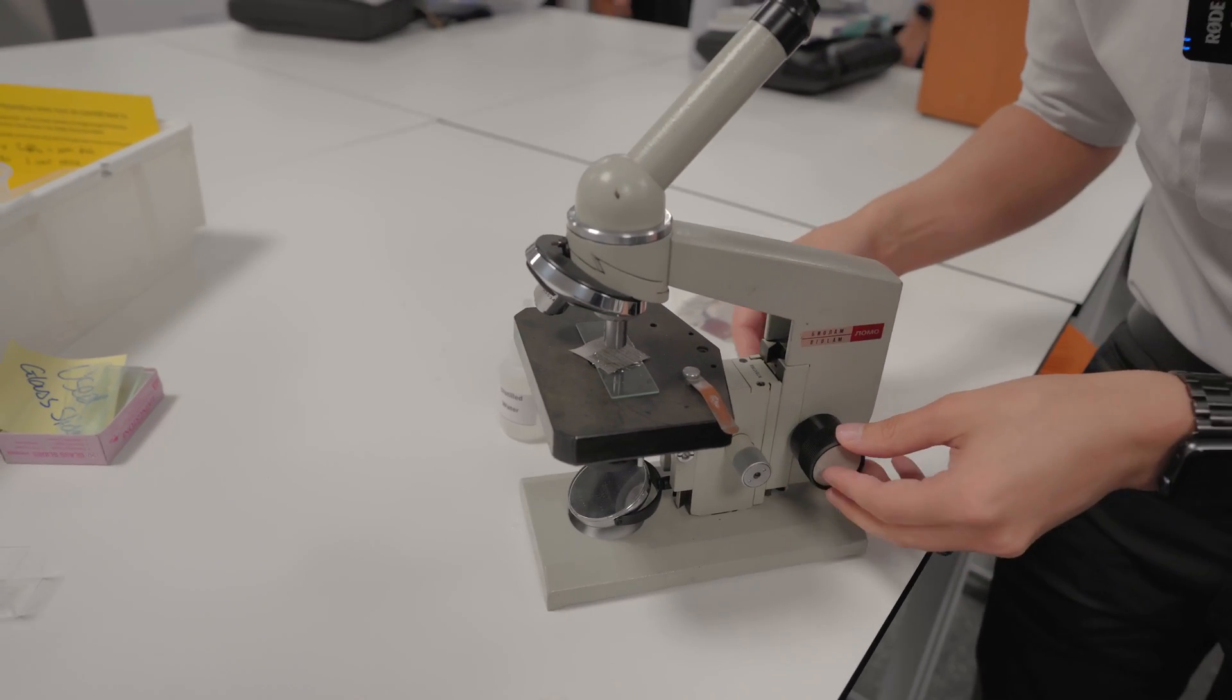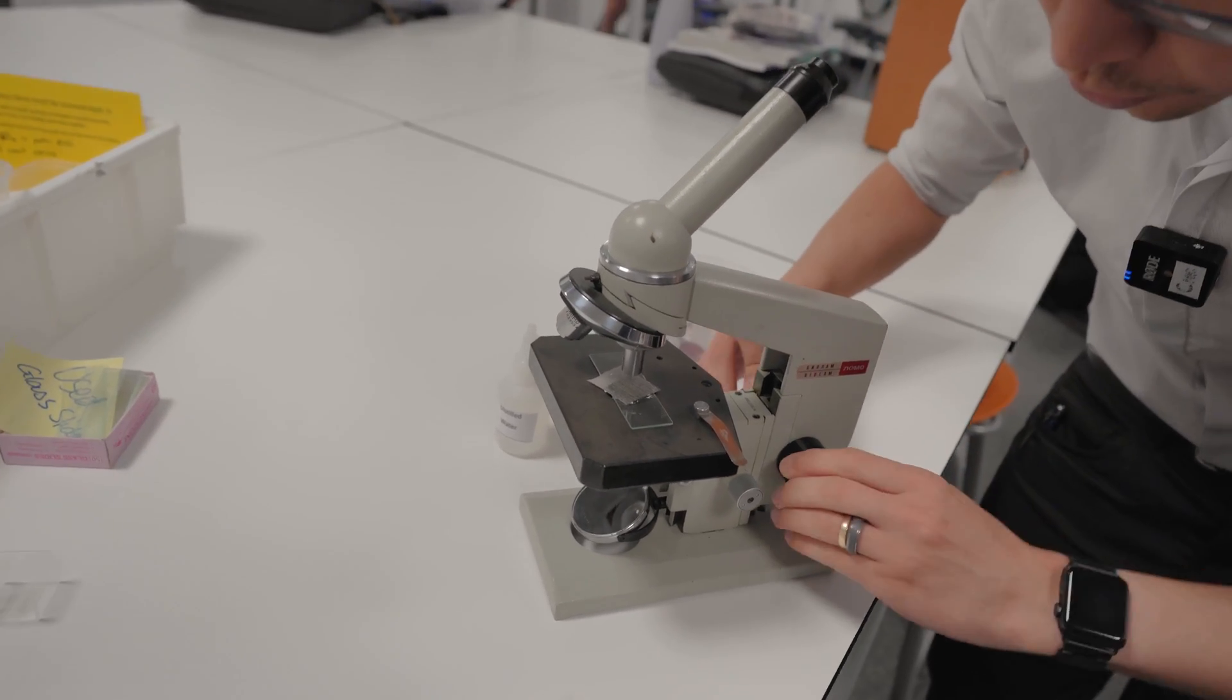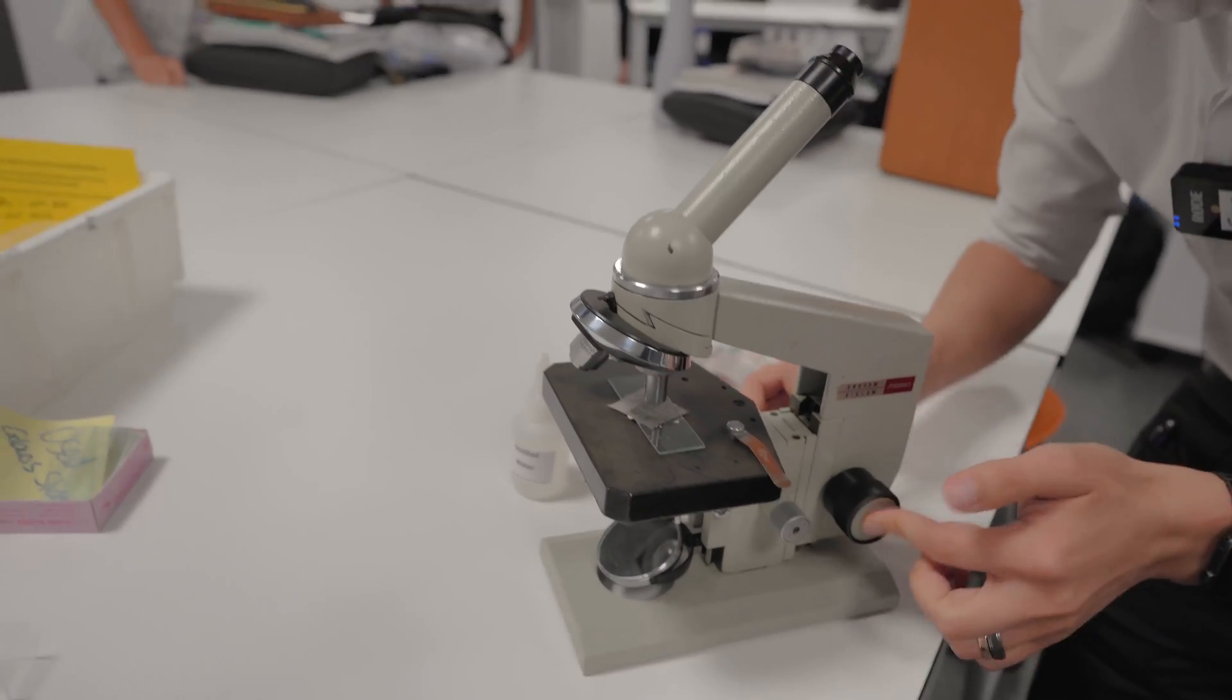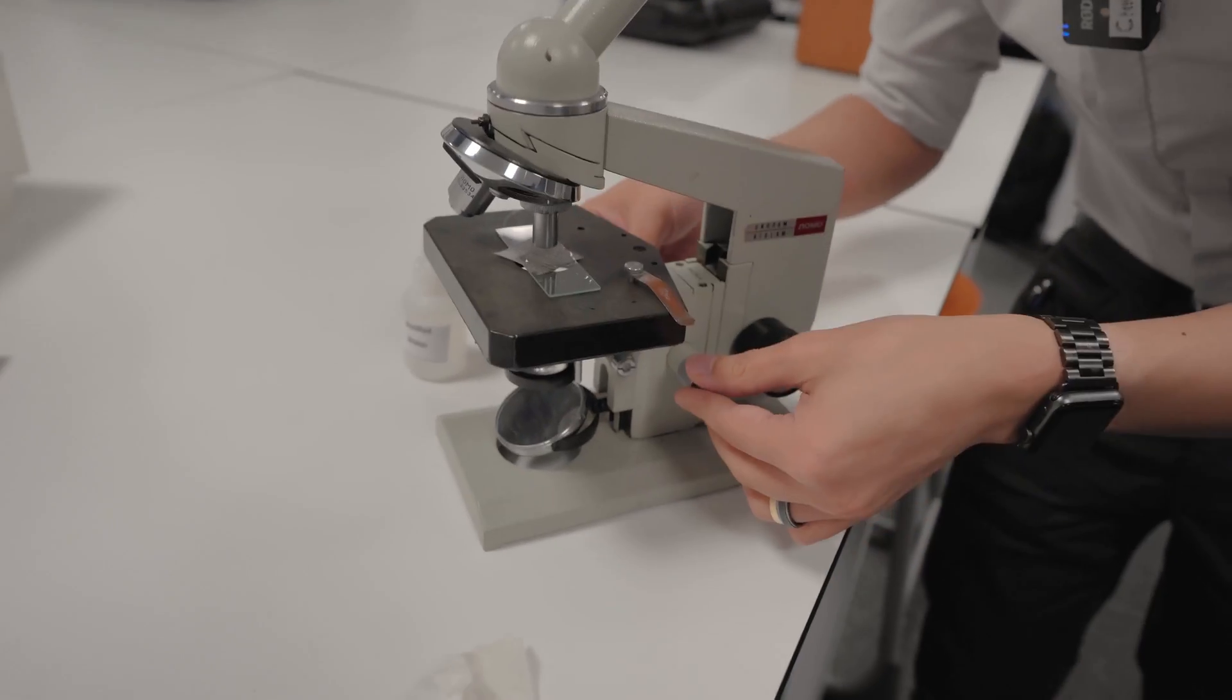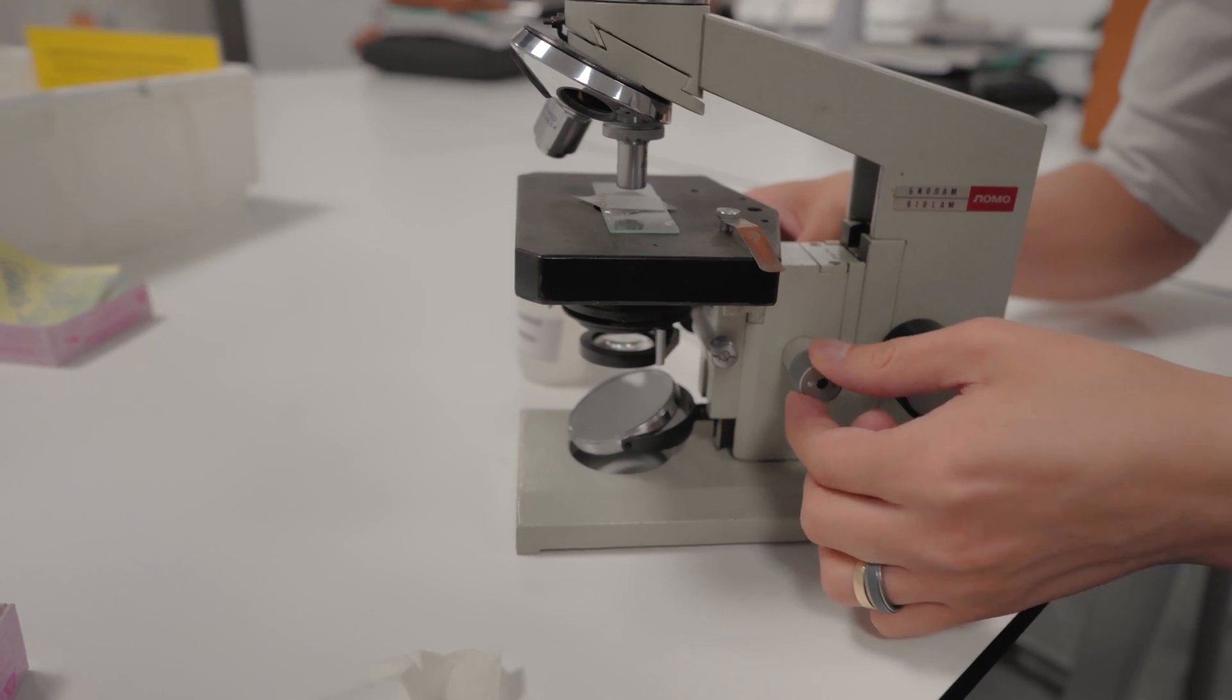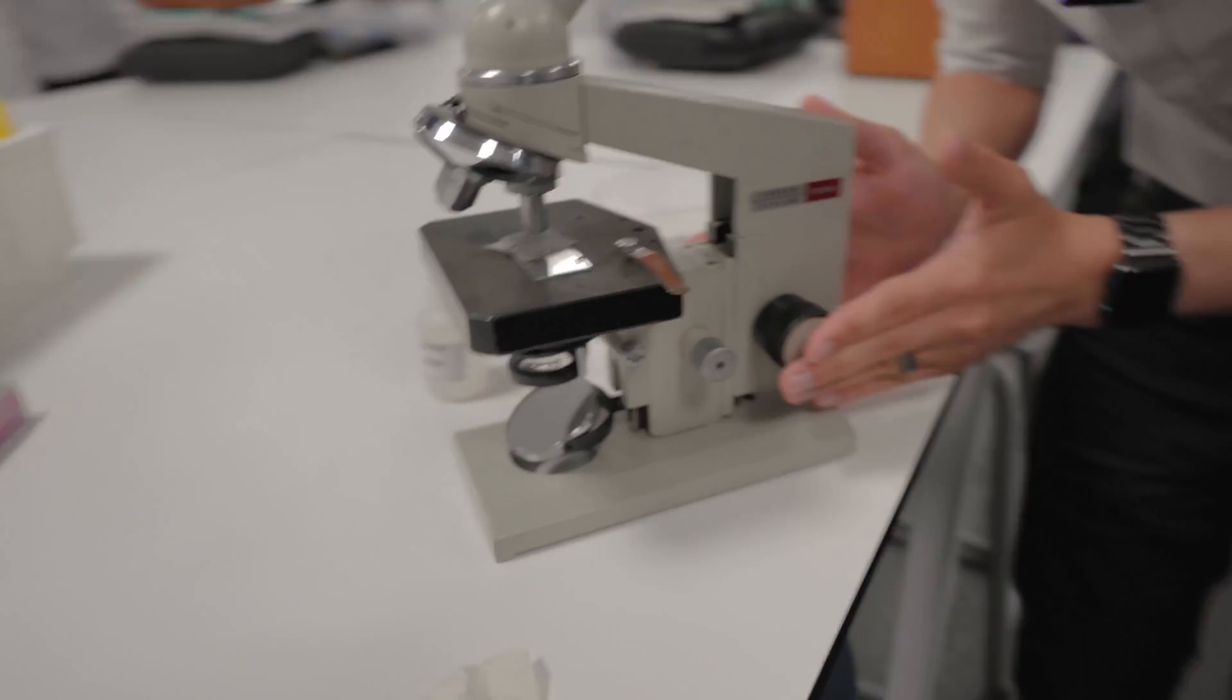Whichever the bigger knob is that's the coarse focus knob. That's used to make large changes. If I turn them they move a large amount and then once you've found roughly where your focus is at you can turn your attention to the narrower knobs. These are the fine tuning knobs and you use this for fine adjustment and then you should have your specimen.